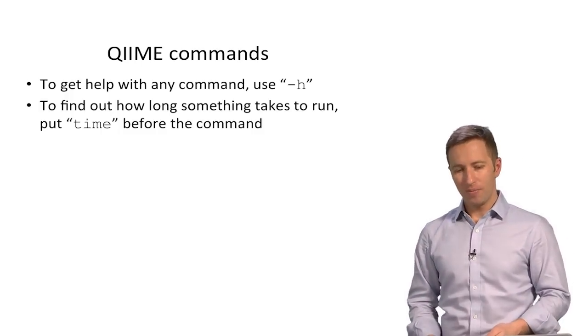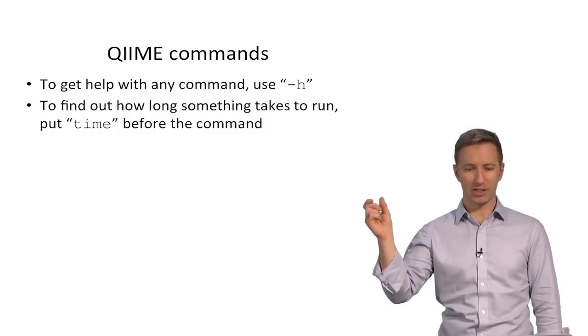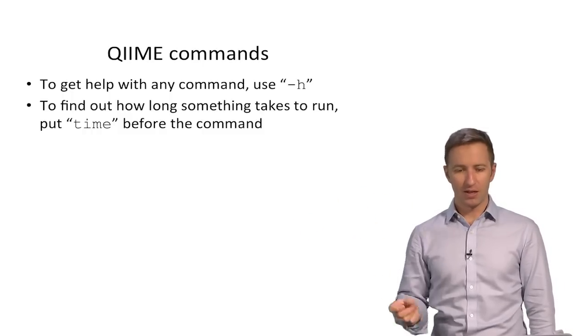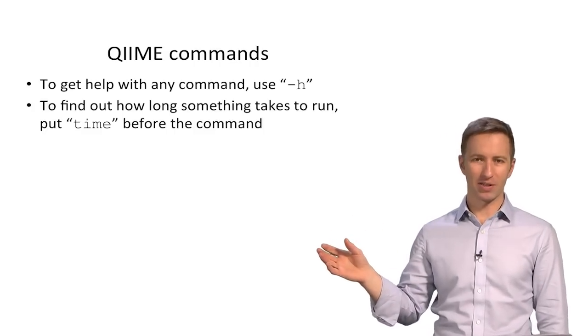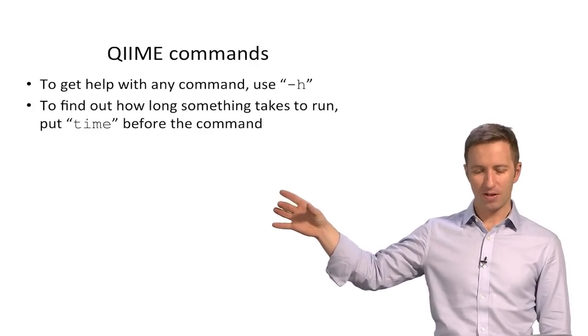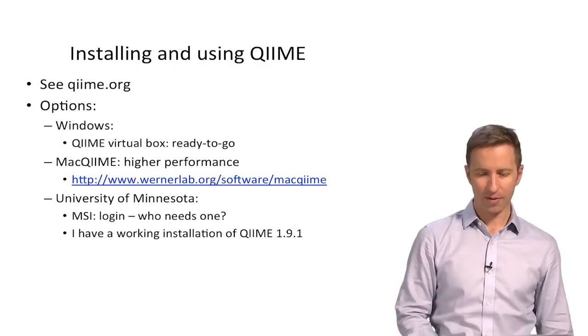When you're running Qiime, if you want to get help with any command, you just type the name of the command and then -h. A little hint for non-programmers: if you want to find out how long something takes to run, you can just put time before it and it'll tell you how long it was. I like to do that.